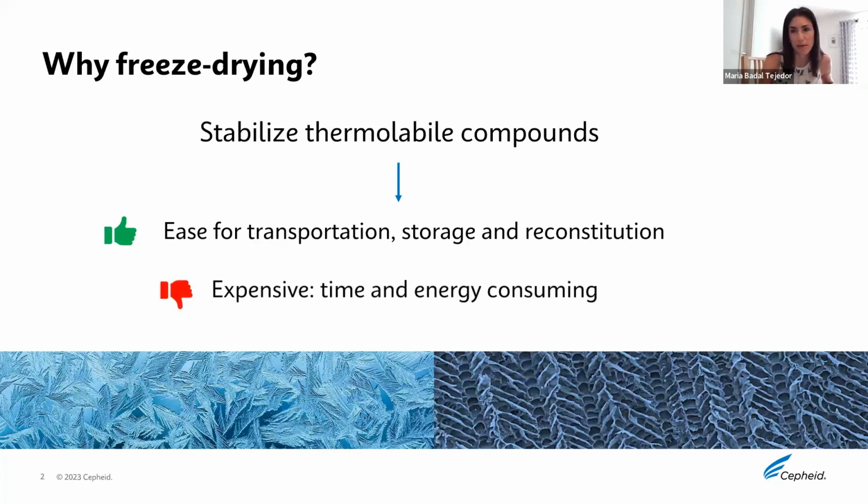But there are also some disadvantages associated with freeze-drying: it's expensive. It's a process that is time and energy consuming, and if we want to make it efficient, we need to really devote time to develop the proper formulation and then to set the proper drying parameters, to not extend the drying time very long. And for that, it's also necessary to have the right knowledge of the technique.